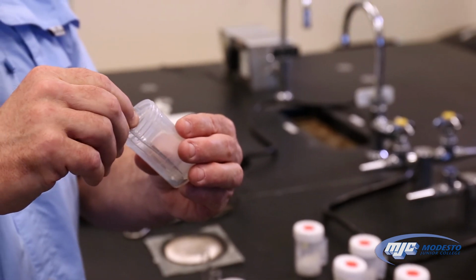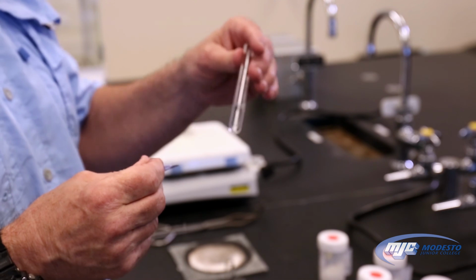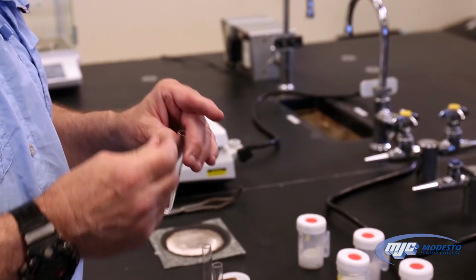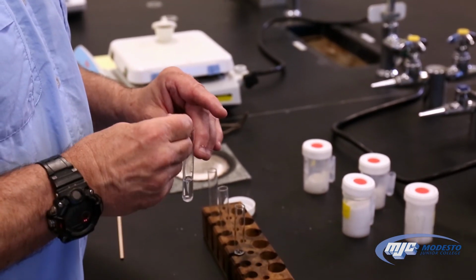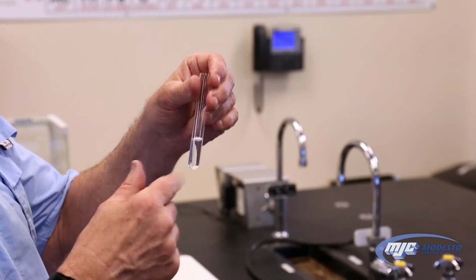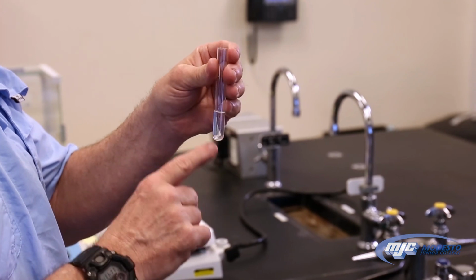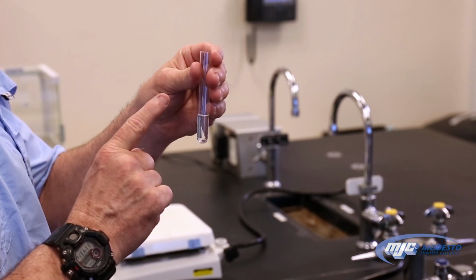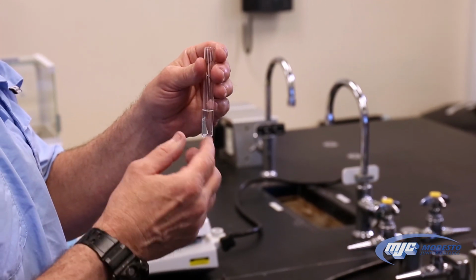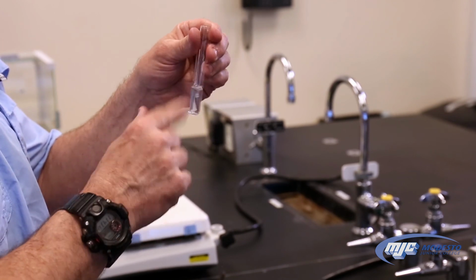So I'm going to take one piece. Drop it in. And usually it floats on the top, so we want to flick it to make sure it sinks. And then we're going to let it sit a few minutes, and we'll come back and look at that, and you'll see what happens if you have zinc sulfate. Remember, if you have zinc sulfate, you're going to get a black coating on what was a shiny piece of magnesium metal. Actually, you can probably see it starting to form already.